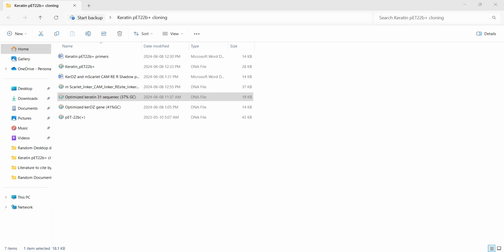And let's label it orange as we did already. And this is how it looks. So let's see whether this is in frame with his tag. It is, excellent. So let's now label BioBrick standard enzymes.